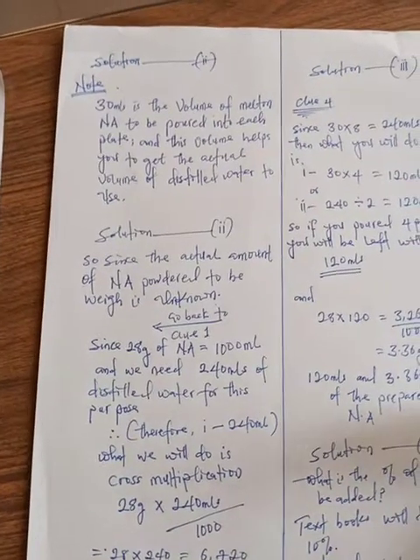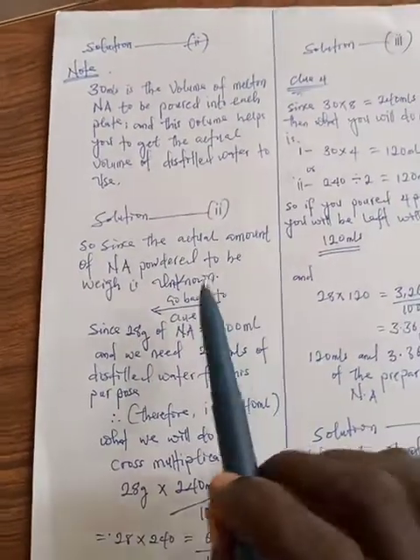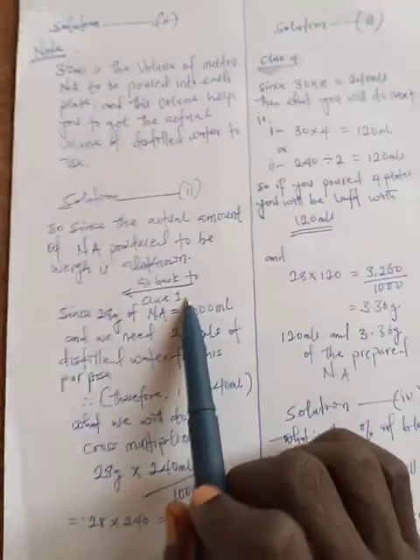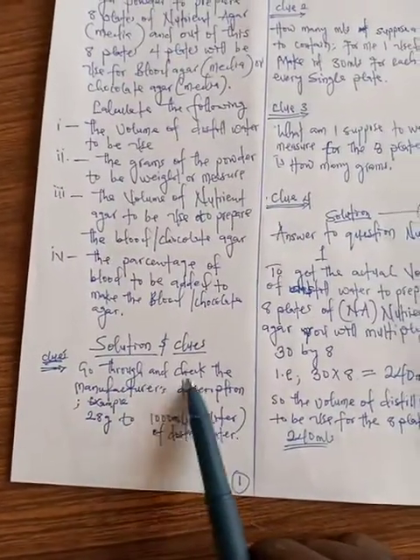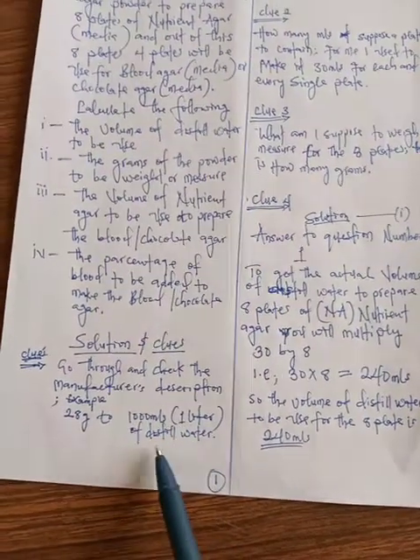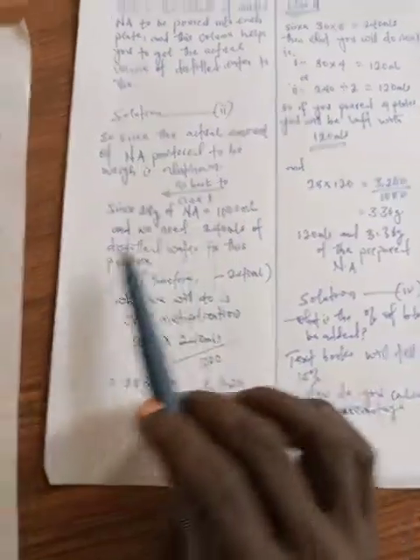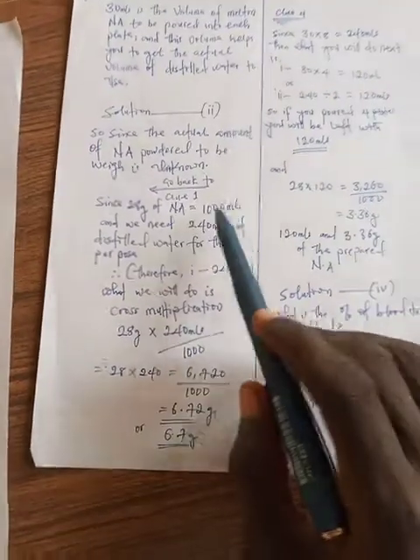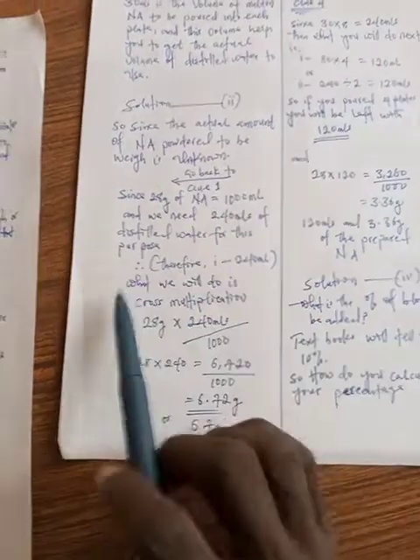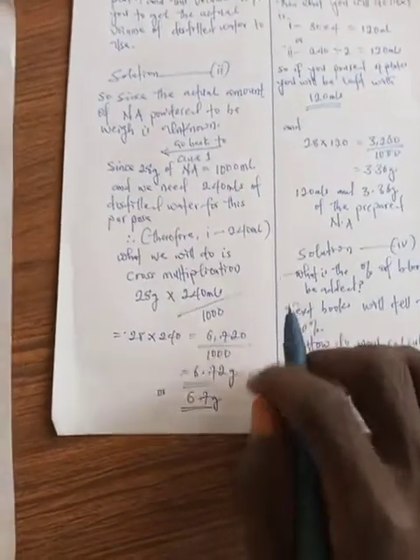It will help you to know what to weigh. Since the actual amount of the nutrient agar powder to be weighed is unknown, what do you do? You will have to go back to clue number 1. What does clue number 1 say? Go through and check the manufacturer's description. Example, 28 grams to 1000 mls of distilled water. So what you will say now is that since 28 grams of nutrient agar is for 1000 mls according to the manufacturer, and we need 240 mls, not 1000 mls, of distilled water for preparing the 8 plates.